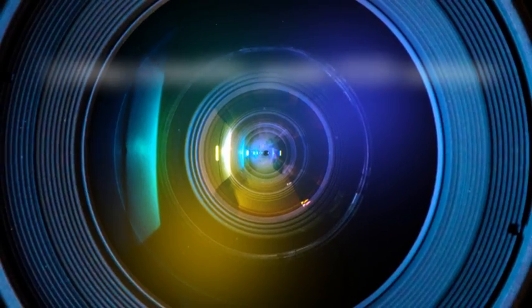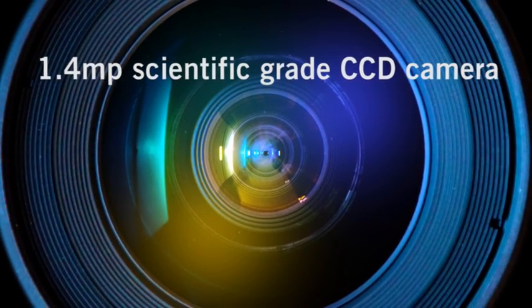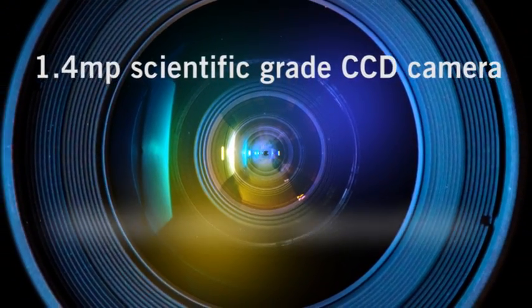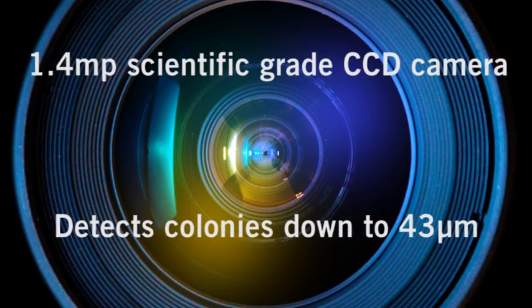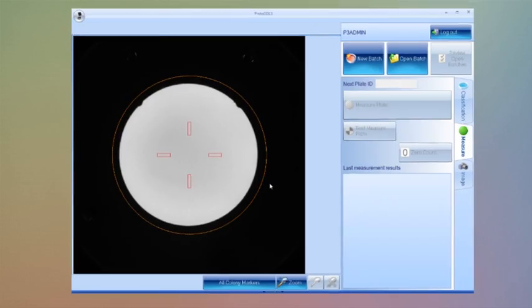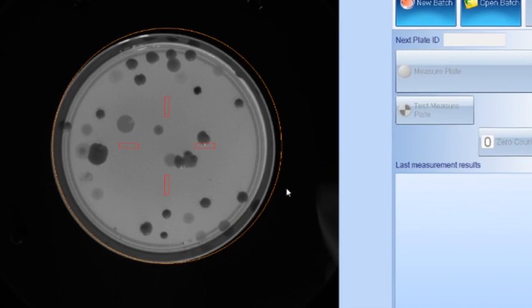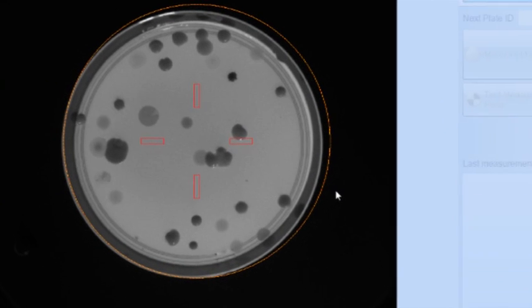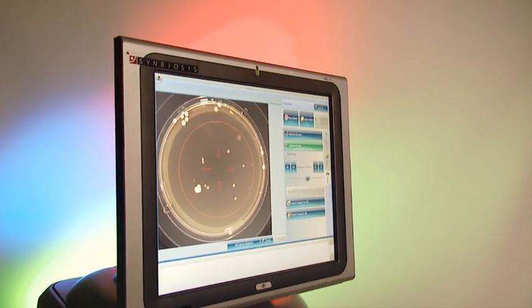It features a high-resolution digital camera, enabling colonies as small as 43 microns to be detected. The camera itself is black and white, providing greater levels of sensitivity than a color camera would.